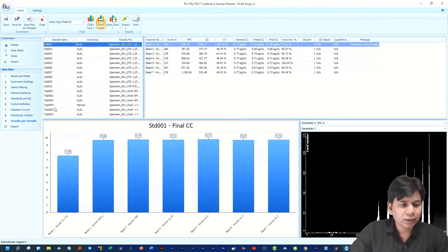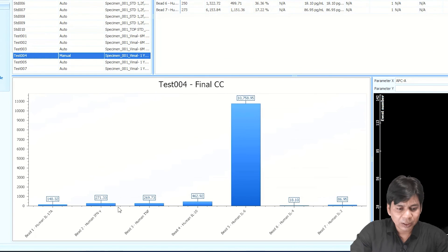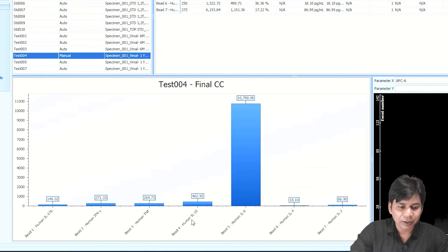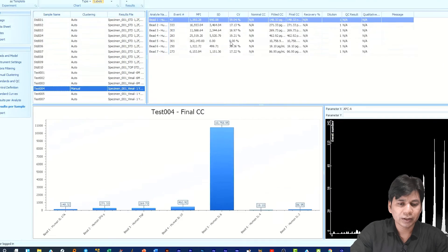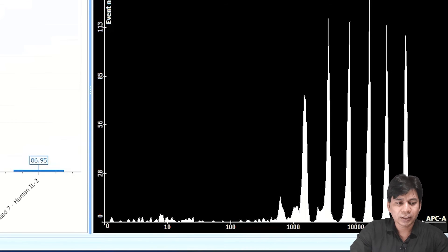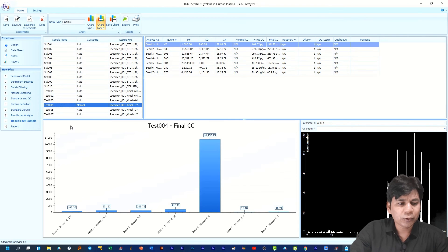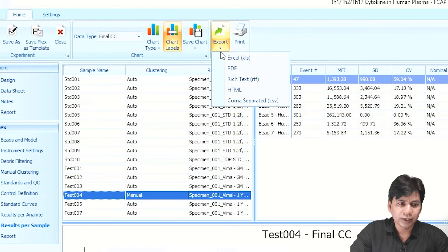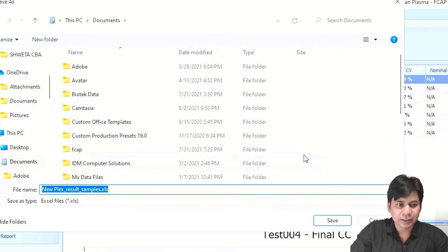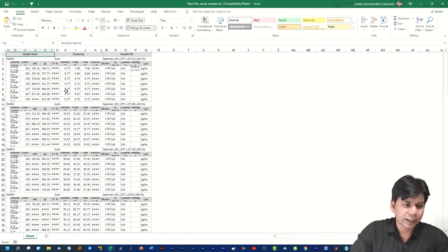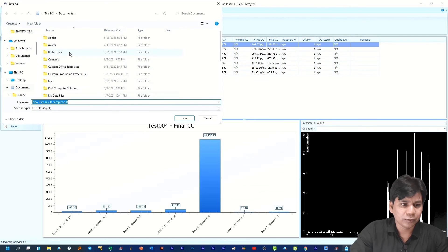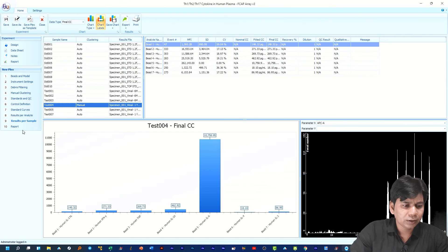If you click on 'Result per Sample,' it shows all cytokine levels for a particular sample. For example, in Test 004 you can see the cytokine levels for IL-17A, IFN-γ, TNF-α, IL-10, IL-6, IL-4, and IL-2 at the same time — in both row and column format. You can also see the cluster of beads in that particular sample. You can export this data by clicking 'Export,' which gives options to export to Excel, PDF, and other formats. Clicking Excel will export the data in Excel format; clicking PDF will export it as a PDF.